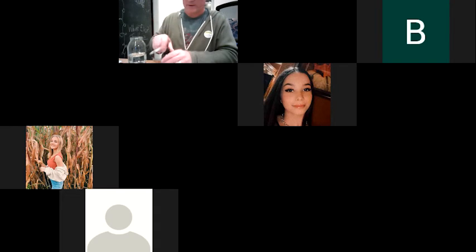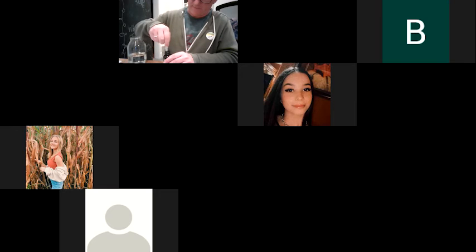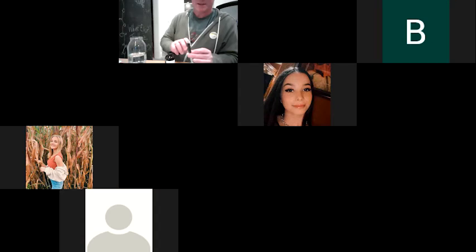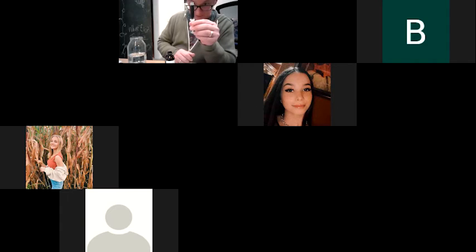So make sure I get all the water out. And then fill this to 5. It should be a very dark color. Oh man, is it ever. Yeah, you can see how dark that is. That is dark. So this is going to be messy. I've already got blue fingers. So yeah, this is going to be messy. I would suggest putting down some newspaper or something like that. I got some shop towels down so I don't stain anything. And it's also going to be a little tricky to read the volume, right? Since this is so dark.